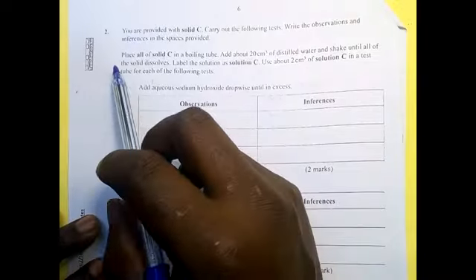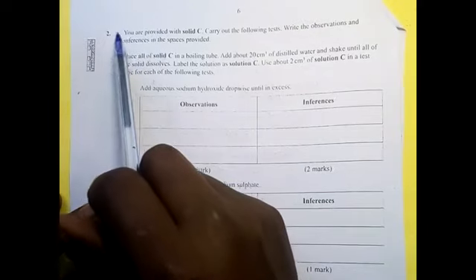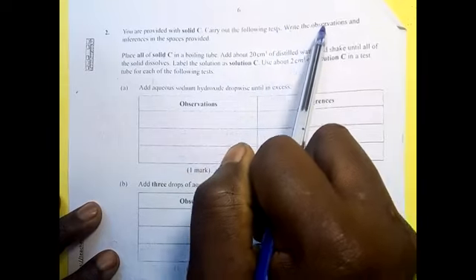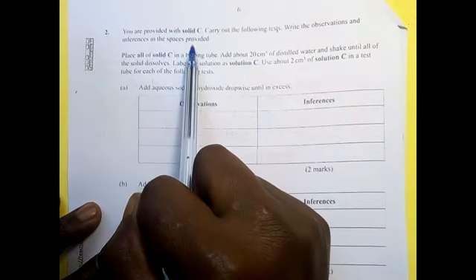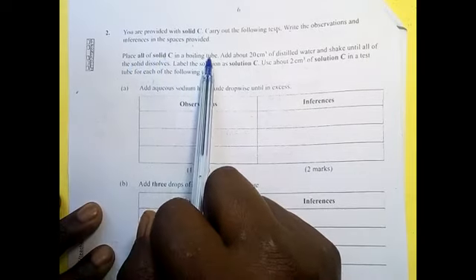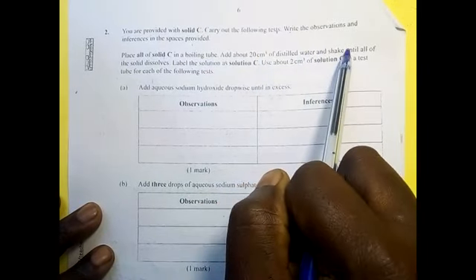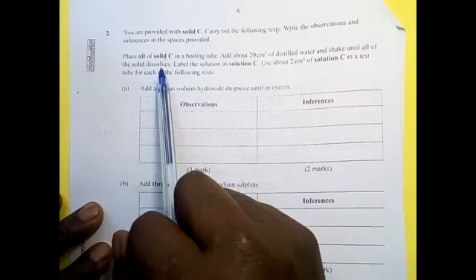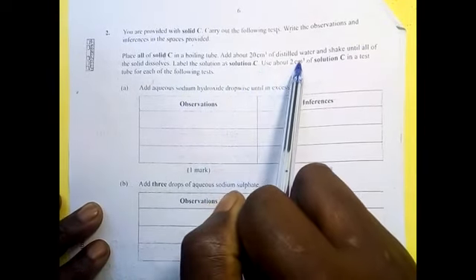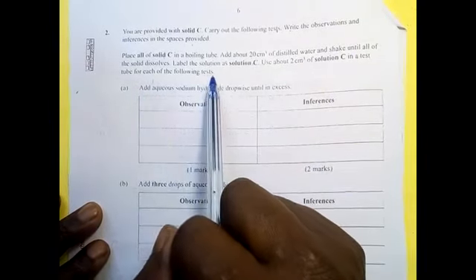Now allow me to take you through the qualitative part of it. Question 2: you are provided with solid C. Carry out the following tests and write the observations and inferences in the spaces provided. Place all solid C in a boiling tube, add about 20 cm³ of distilled water, and shake until all the solid dissolves. Label the solution as solution C. Use about 2 cm³ of solution C in a test tube for each of the following tests.